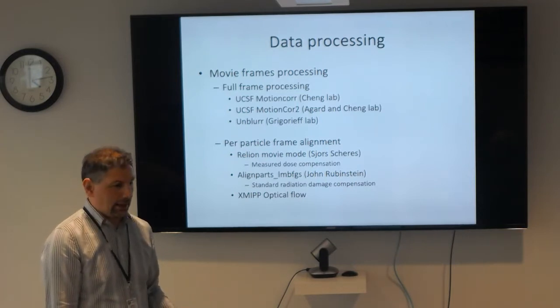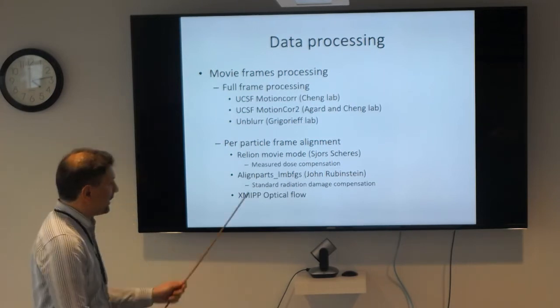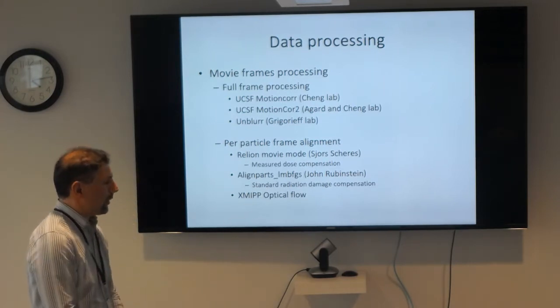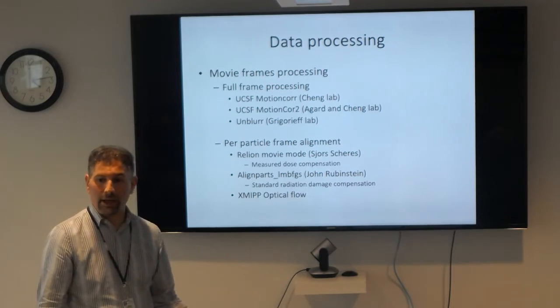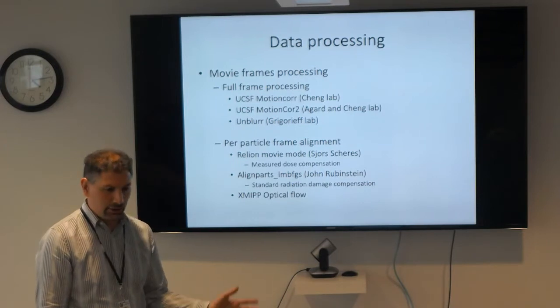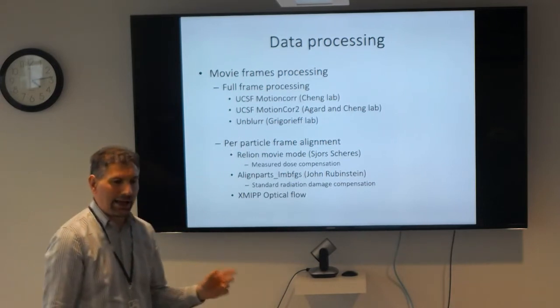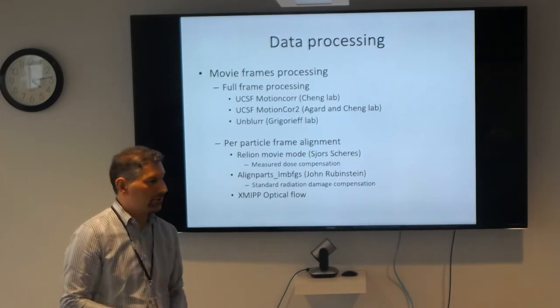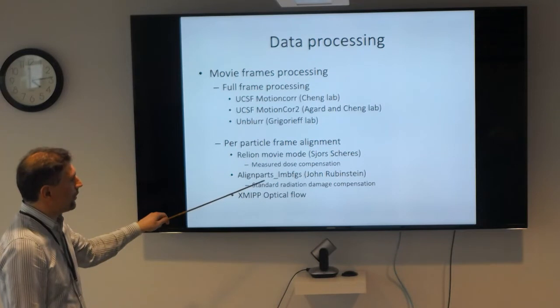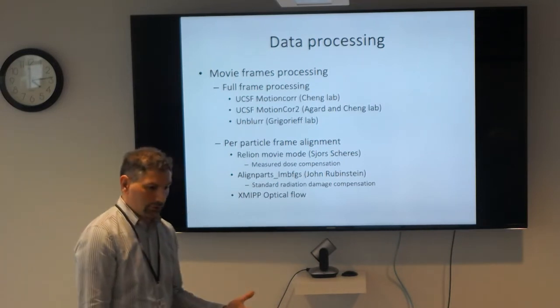with it. Again, if you have tiny particles, you might want to think about doing these additional things and doing, for example, align by each individual particle itself. But if you have big chunky things like ribosomes, large megadaltons, then you're fine doing the MotionCor2, and it has this patch option where it breaks the micrograph into smaller patches and aligns those patches. So essentially, it's somewhat of a looser way of doing something like per particle drift correction. Okay.